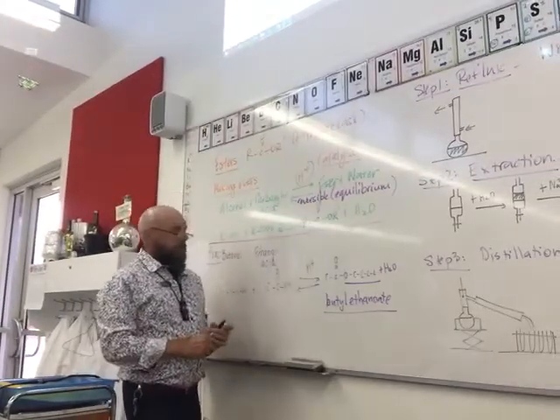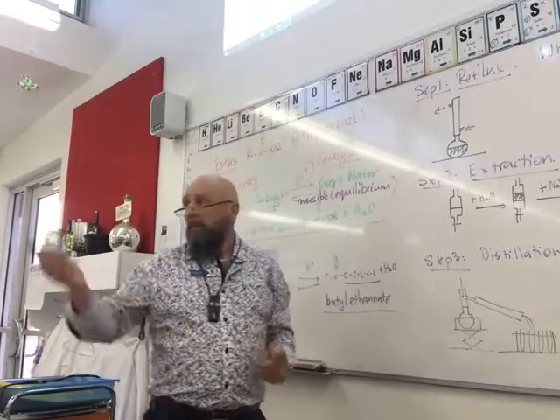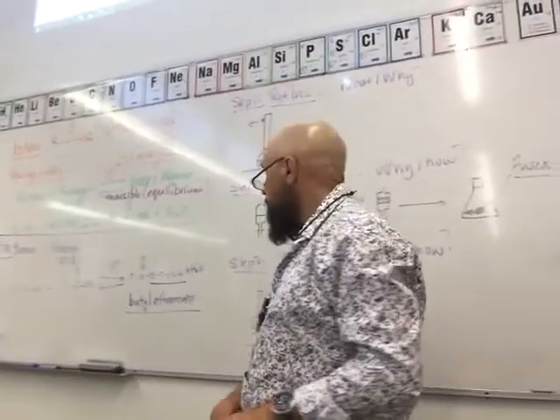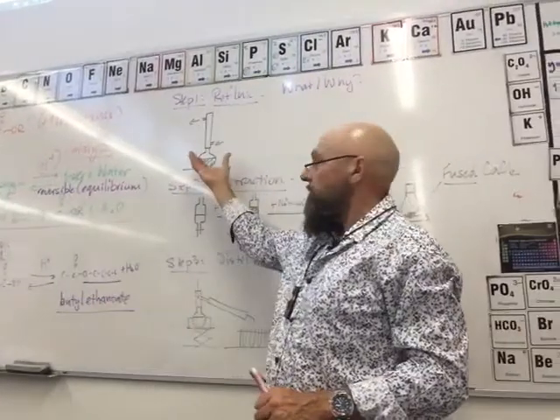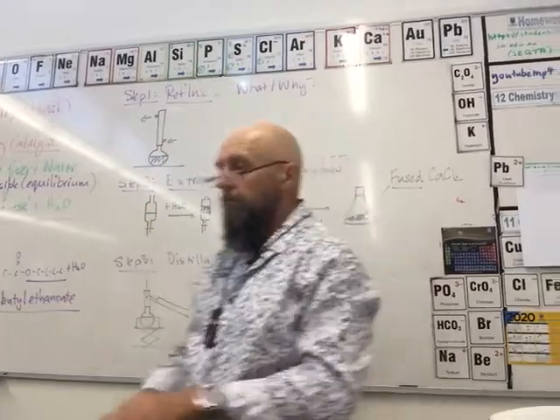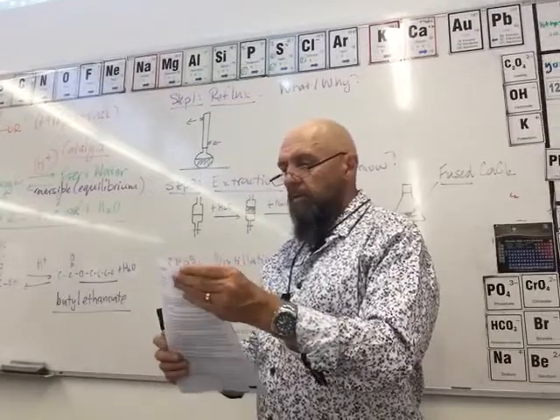So the next thing is, we actually do that in the lab. There are 3 clear steps, and the 3 videos are sitting in the lesson for you anyway, so you could virtually not be here and see how to do the experiment. The first step is what we call reflux. We set everything up in a round bottom flask, as we've done all along, using the procedure that is given to you, step by step, and we might change the volumes. We'll cross that bridge when we need to.